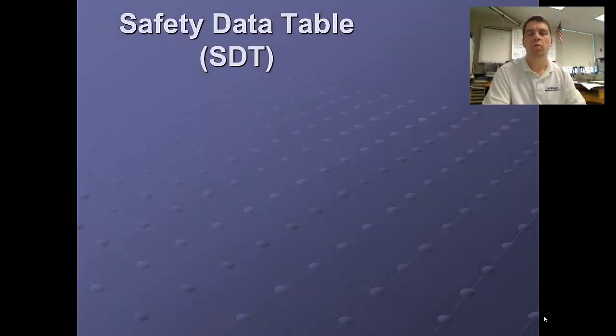A safety data table is something that we compose before any lab that we do, simply for the fact that when we read the procedure and we see what chemicals we need to use, it's important to be able to recognize the chemical in terms of, is it a solid, is it a liquid, is it a gas, does it have a color to it, is there an odor to it, different ways that we can identify it with our senses. But also, and perhaps more importantly, we need to be aware of any potential hazards that might exist for that substance. By knowing those hazards, we can know ahead of time what sorts of precautions in particular we need to make.